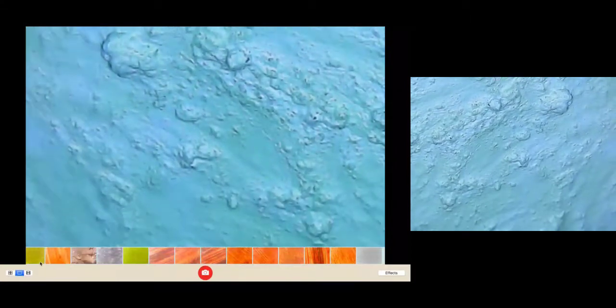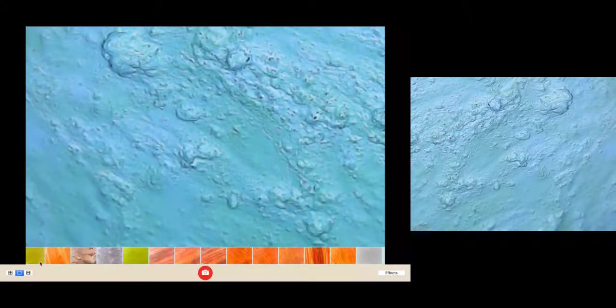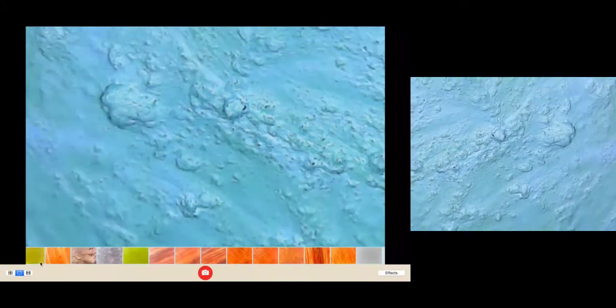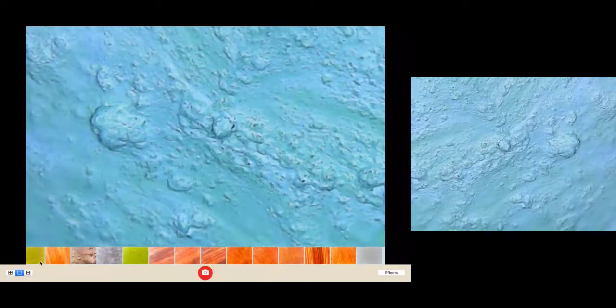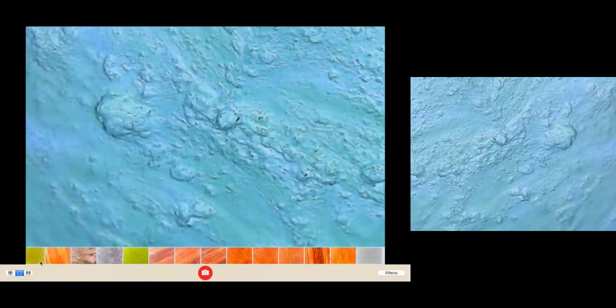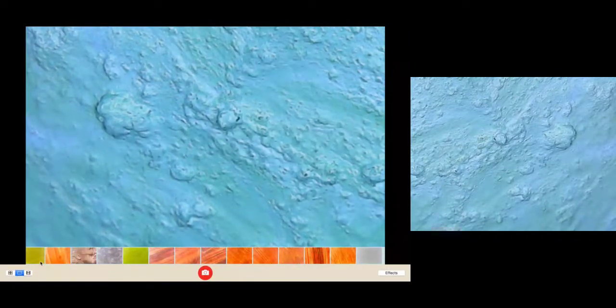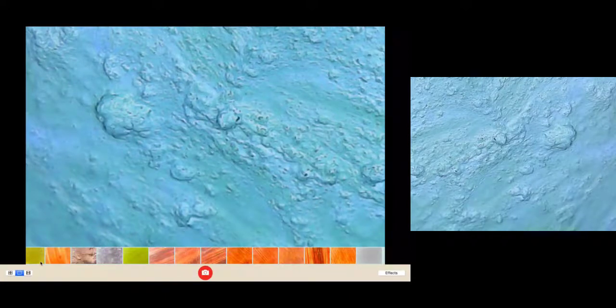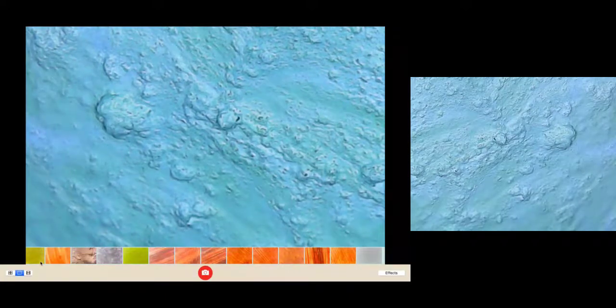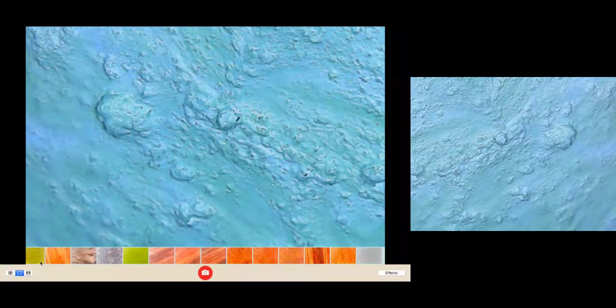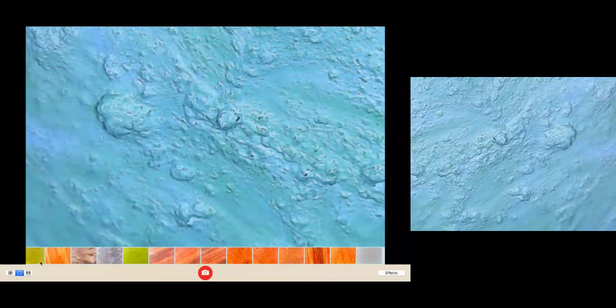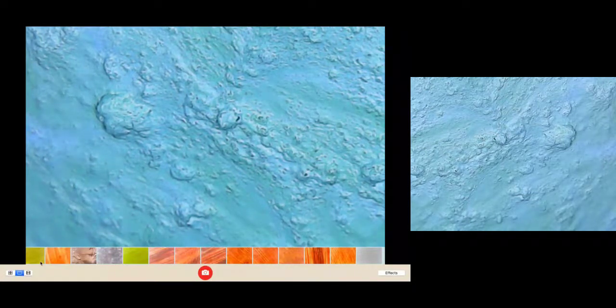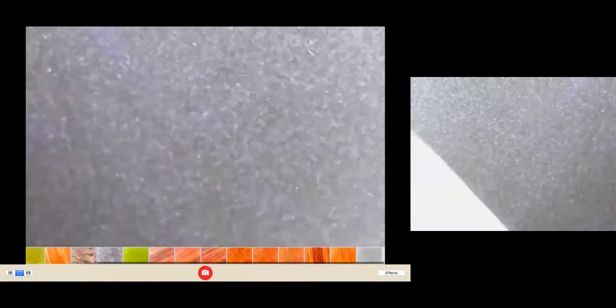Even parts of the Earth, Western United States. It's really fascinating. It's an excellent microscope for $20 plus postage. I got it in about three days. It can magnify anywhere from 40 up to a thousand times.